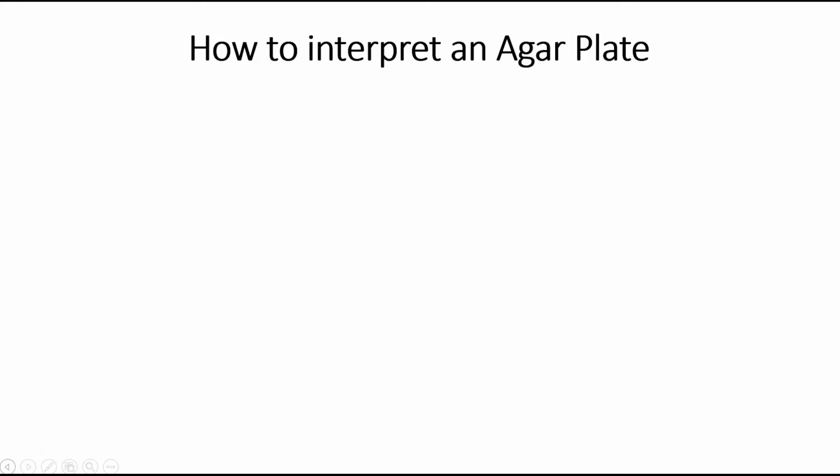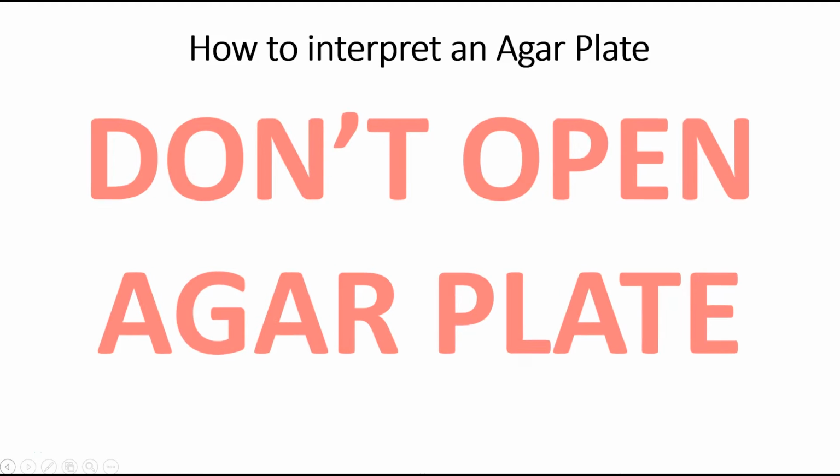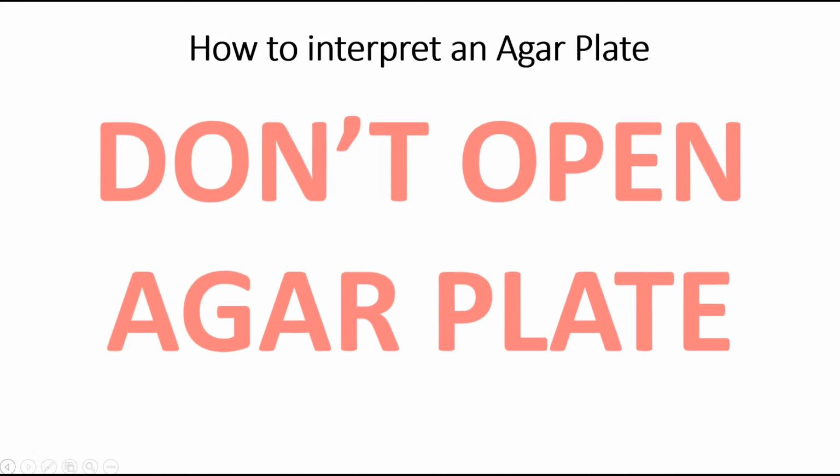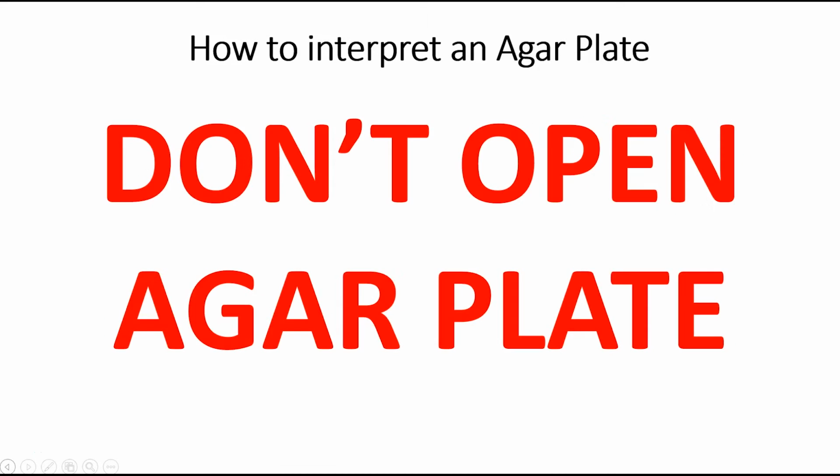Alrighty, so really quickly, I'm just going to go through how you interpret an agar plate. But first things first, do not open the plates, leave the parafilm on them. They need to stay shut.